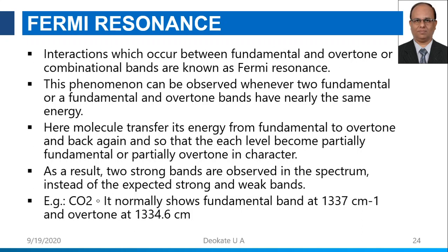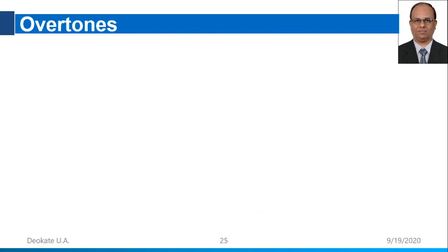A vibration of large amplitude is produced by a relatively small vibration. You can distinguish between Fermi resonance and coupling of vibrations: Fermi resonance occurs at the excited state, therefore it is different from the coupling one.